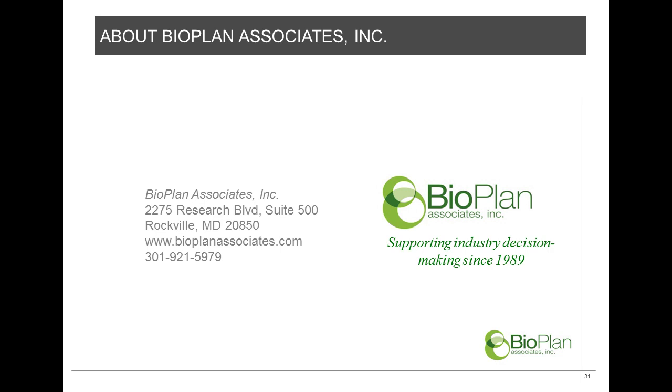Now that said, it might be that there just weren't enough inline buffer dilution users even in the large group that we initially interviewed to be able to make that differentiation. So that is an example of where, as you run through the model, you may need to say, well, it does not account for X, and that might be one of those areas where it doesn't account.